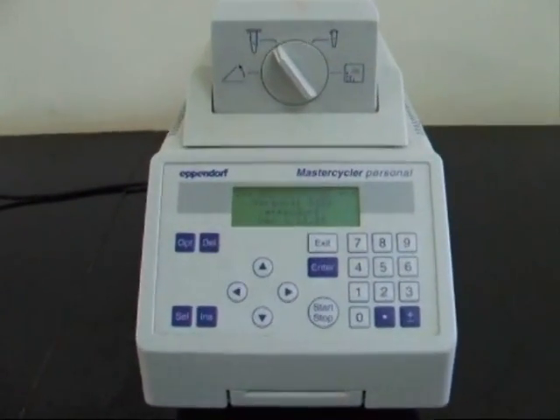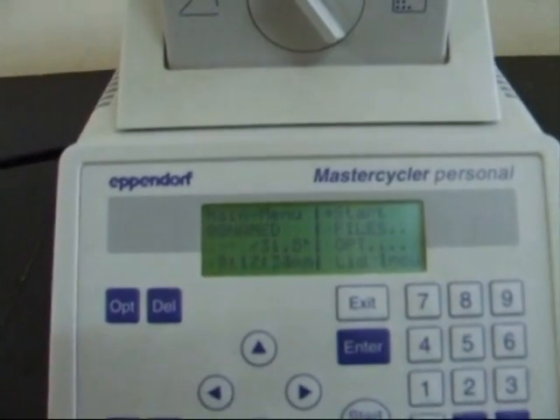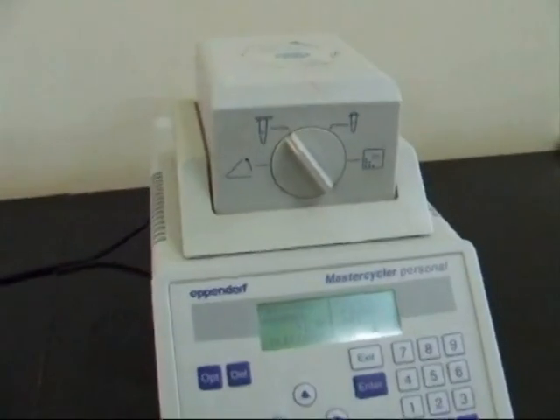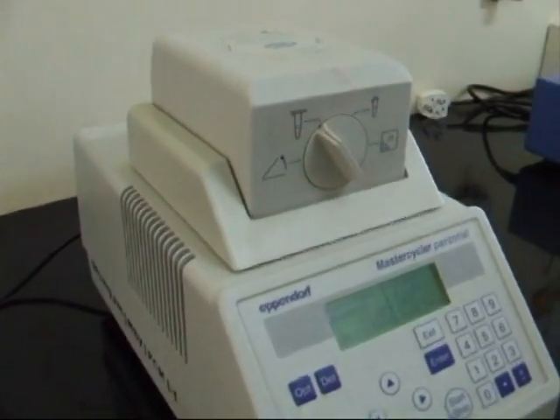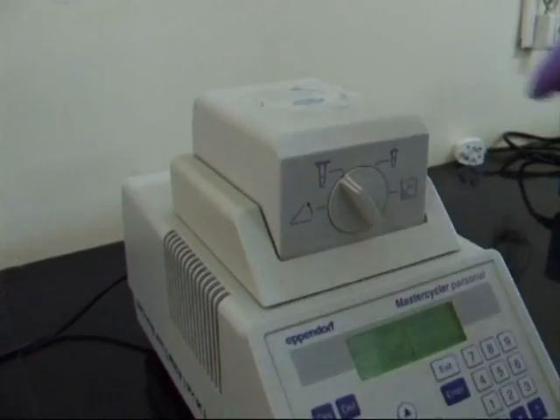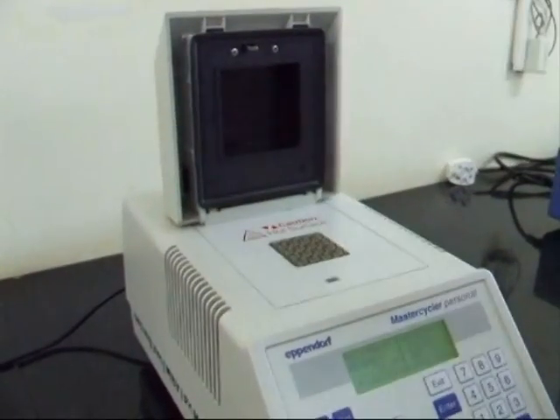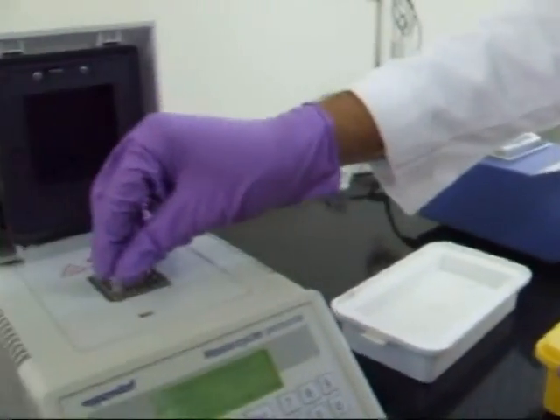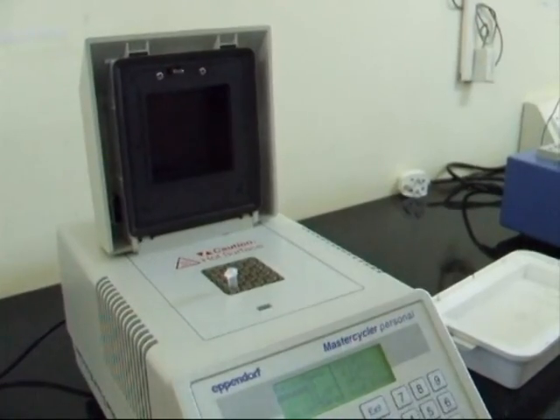This is a thermal cycler. Switch on the thermal cycler. Place the PCR tubes in the thermal cycler and set the thermal cycler for the following conditions.